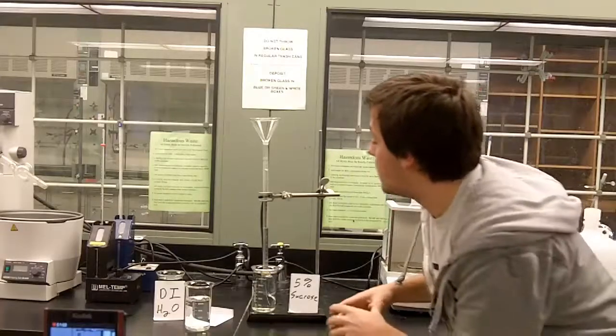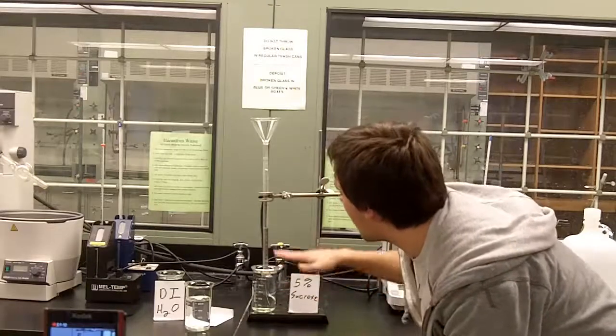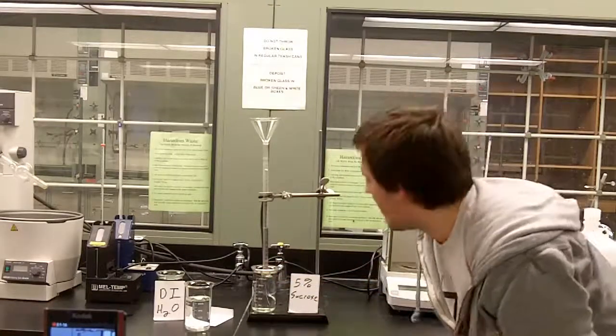So as you guys can see, the water did move. The water level went out — the water level should have dropped, as you can see right here.